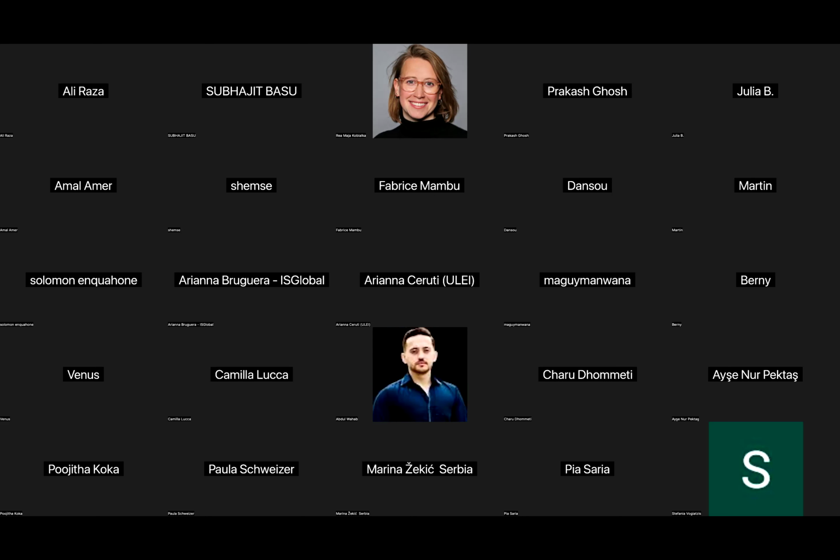Dr. Prakash, according to my literature research, I didn't find any exact figure for the sequencing depth for metagenomic data using Oxford Nanopore technology. If you read any paper regarding the sequence depth that is essential for metagenomic data obtained from Oxford Nanopore technology, you can tell me, it would be very helpful.